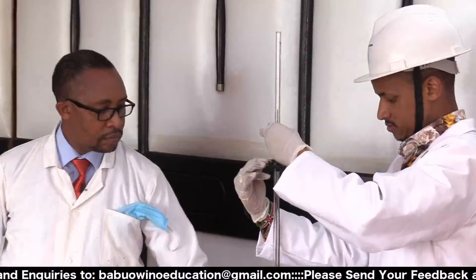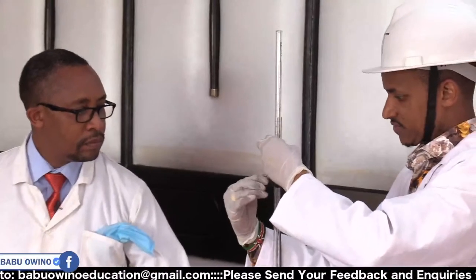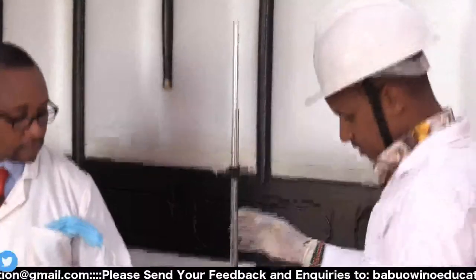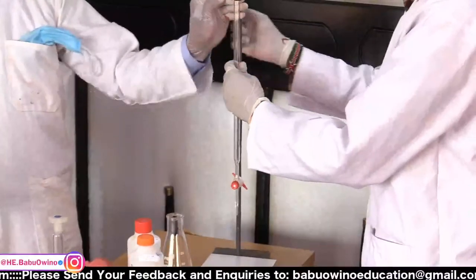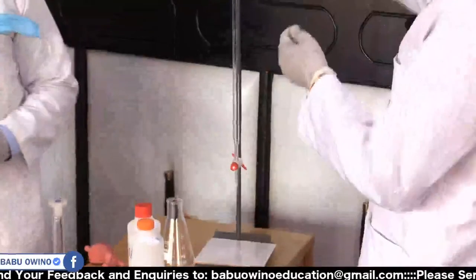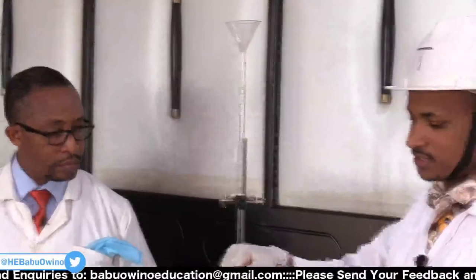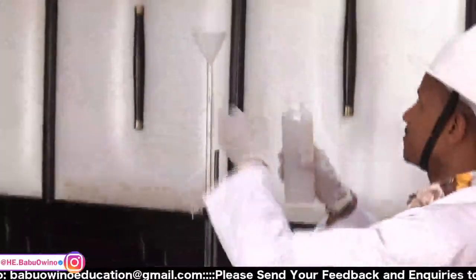So ensure that it is firm, not too tight, because you may break the apparatus. That's fair. Then after that, at least it can slightly move. Okay, good. Then after that, you fill it using the HCl. You be careful with the acid because it is very corrosive.